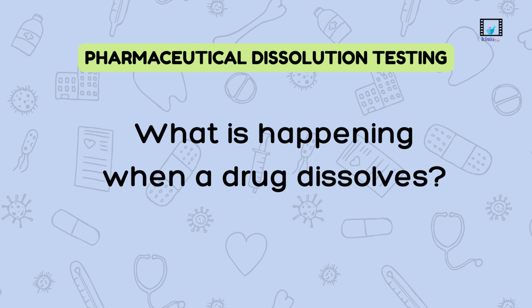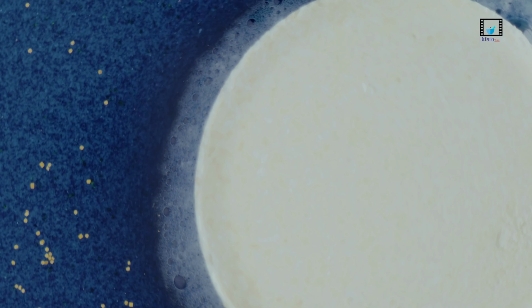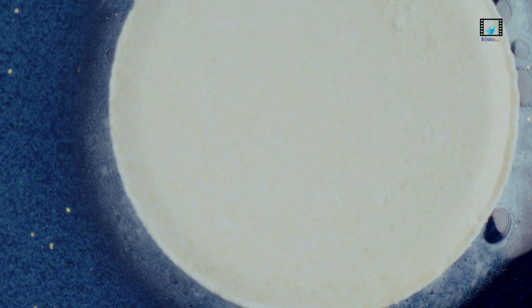Now, let's peek under the hood. What's actually happening when a drug dissolves? Imagine a tablet dropped into fluid. Drug molecules begin to escape from the surface and move into the surrounding liquid, spreading from areas of high concentration near the surface to lower concentration farther away.